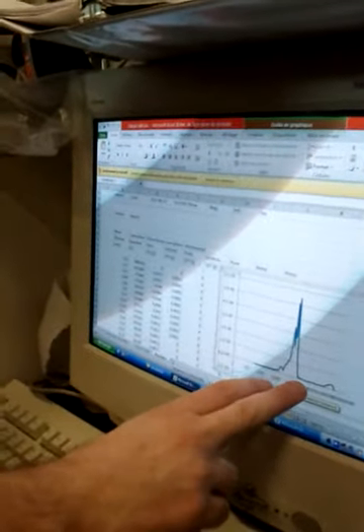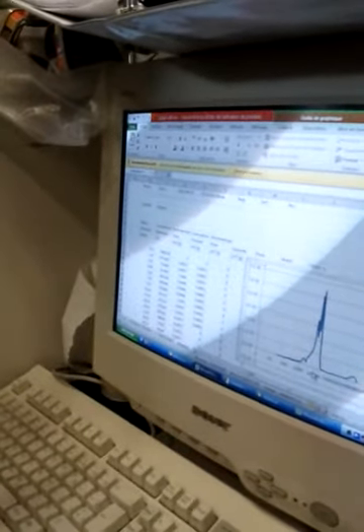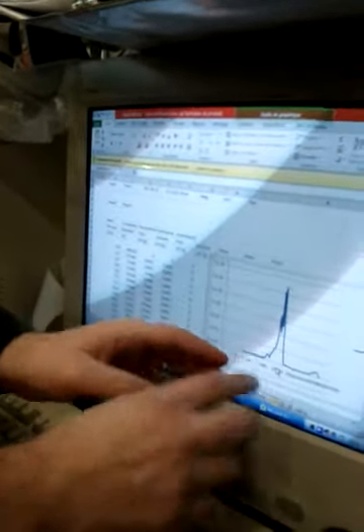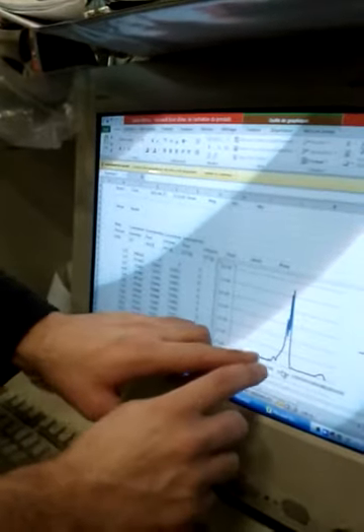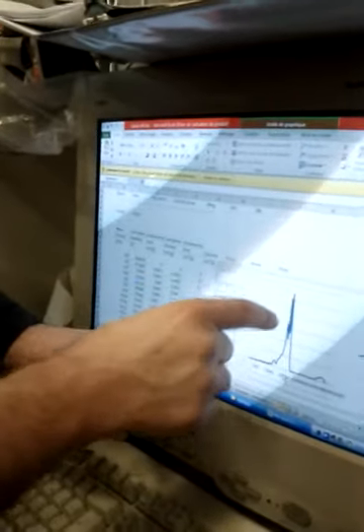For example, if we compare the result obtained with slag-based binder or Portland cement, usually the porosity is thinner for slag-based binders than for Portland cement, and we can see this with this graph, because if the pores are thinner, we will have the curve like that. There will be a gap between the two.